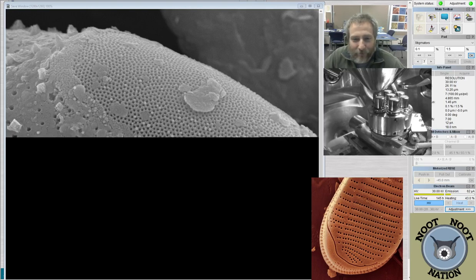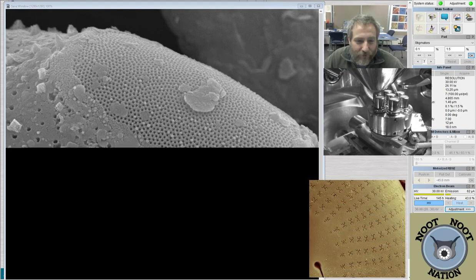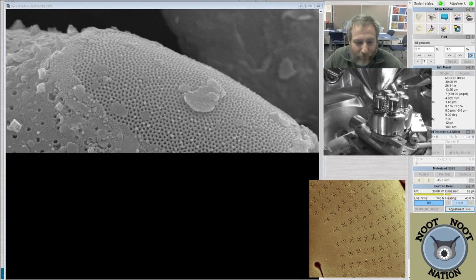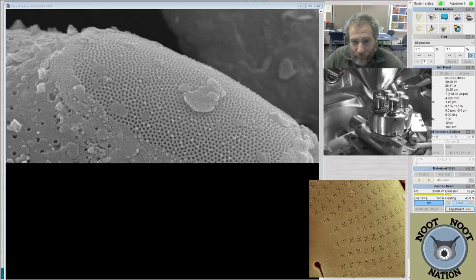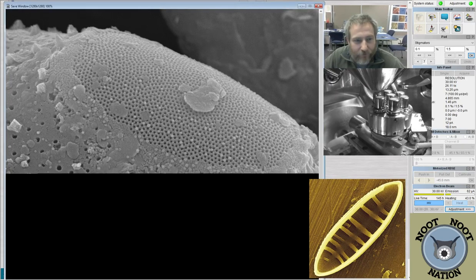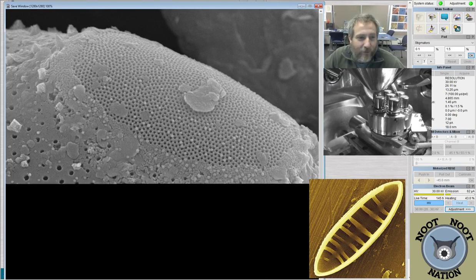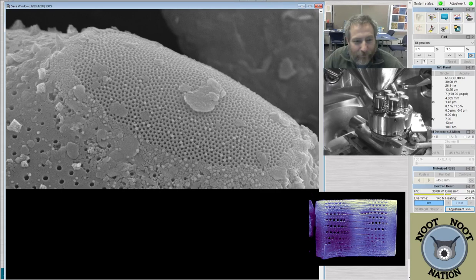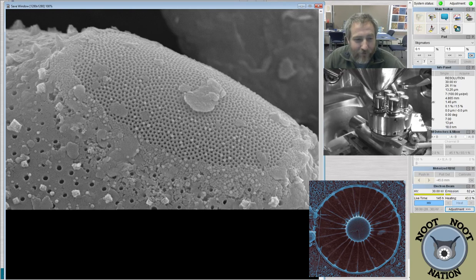It's nice and cool, calm, nice quiet stream from the SEM. That constant buzzing noise you hear in the background is actually the pump for the SEM, which has to run in order for us to collect images and operate the instrument. So it's just part of our full ASMR service here, with the visual ASMR with the SEM, and then my gravelly voice that I use when I'm talking into a microphone that's close to me, and the pump in the background.